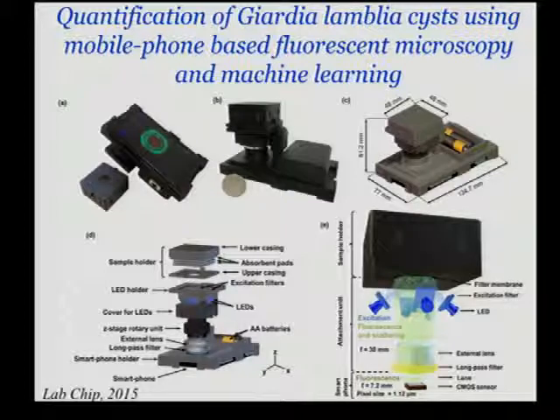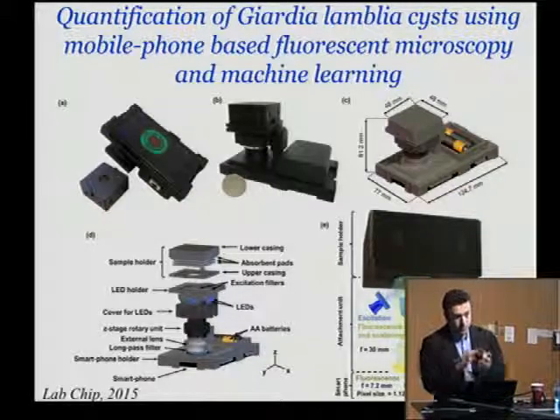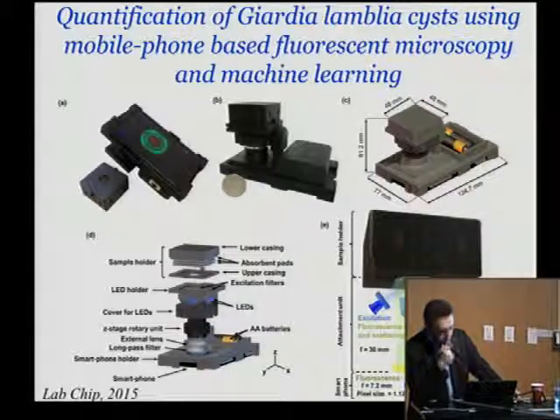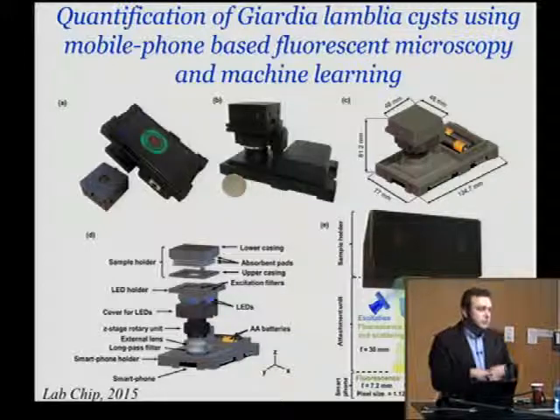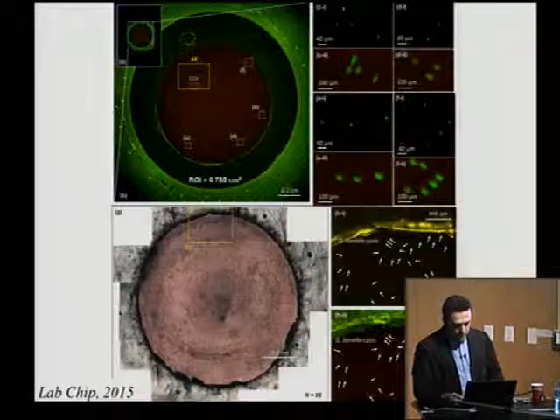It will capture a certain size, in this case, Giardia cysts. These are cysts that infect a lot of the US cases for waterborne related diseases are due to Giardia and cryptosporidium. And in this domain, this is one way to capture across a large volume and be able to recognize them through their unique shape.